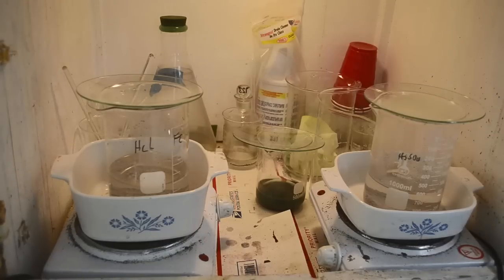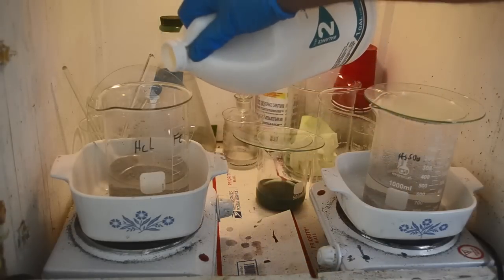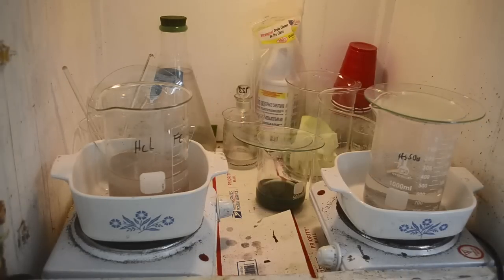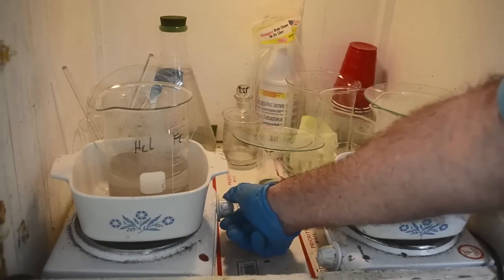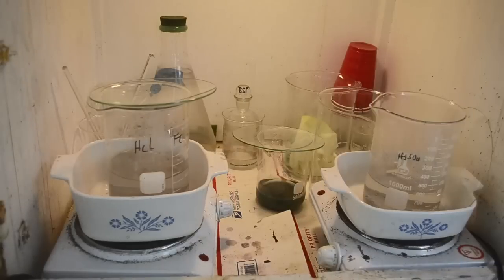Okay, I turn the fume hood on before I start making fumes. Put about 100 milliliters in here. About 100 milliliters. Turn the heat on. Get it boiling. Alright, and over here, grab this stuff.